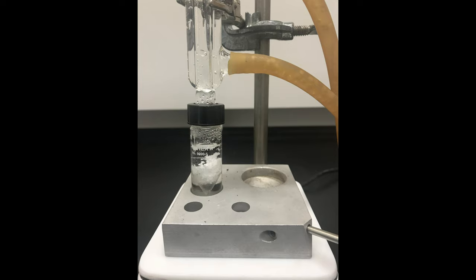A close-up view of the reaction vessel shows a white solid. This white solid appeared just as I added the sodium hydroxide. So, our methyl salicylate is insoluble in sodium hydroxide, which is aqueous. I can just start to see some vapors forming at the top of the reaction vessel here. So we're getting closer to actually boiling and being under reflux.